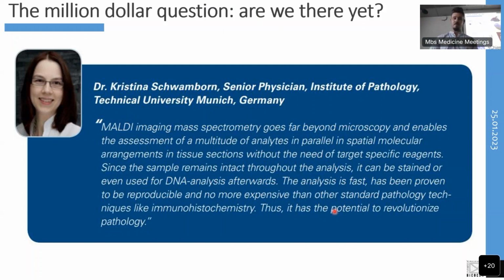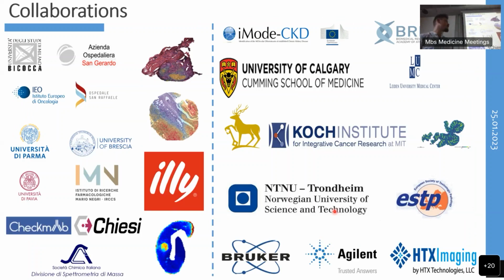So in addition to this line of work, we have a number of ongoing collaborations, some of them internally within the University of Milano Bicocca, some at academic institutions within Italy, but as well within industry. In particular, we're currently running a study in collaboration with Illy Cafe as well, so the weird and wonderful of MALDI imaging, if you will, where we've been using this technology to try and detect bioactive compounds within coffee beans, so the molecules which provide the coffee with its specific properties.